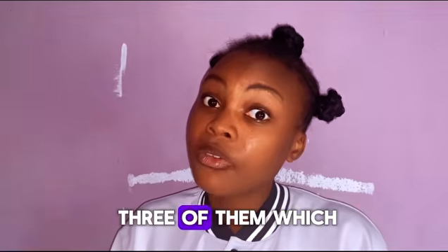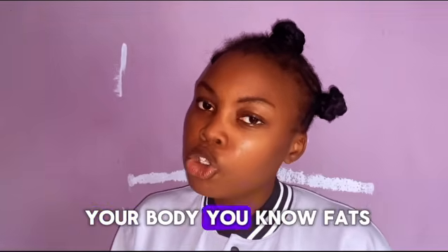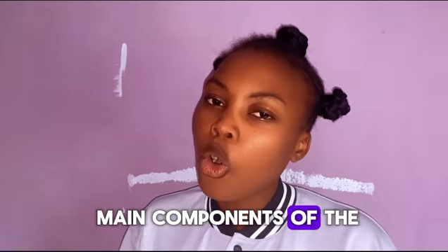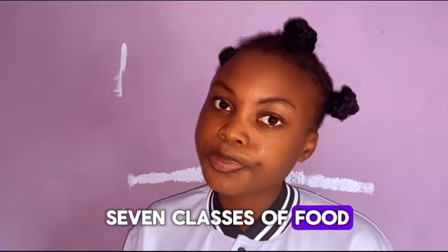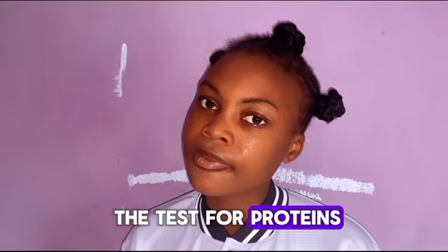Let's look at three of them, which are the main components in your body. You know, fats, proteins, and carbohydrates are among the main classes of food, and even the main components in your body. So let's look at the test for proteins.